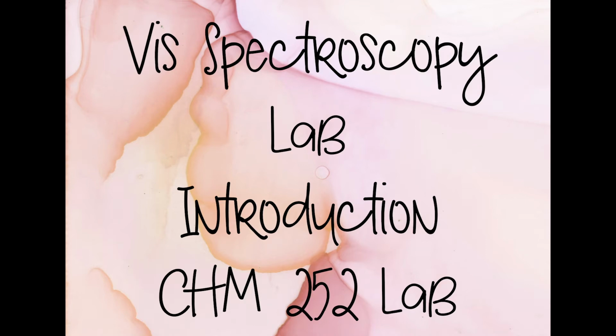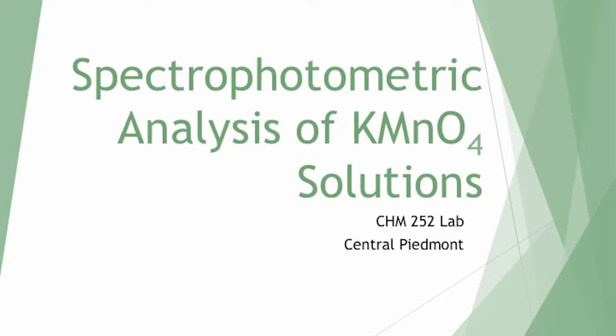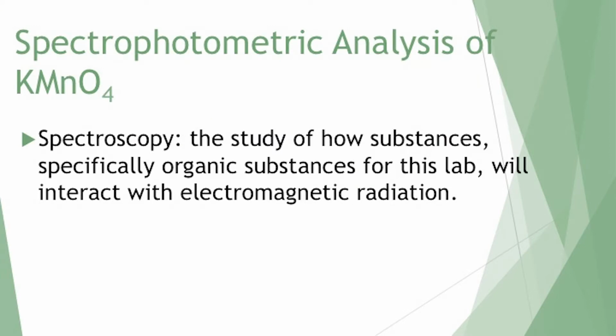Today's lab we're going to look at visible spectroscopy of a potassium permanganate solution. And when we look at the term spectroscopy, spectroscopy is really a study of looking at how substances, primarily in this class organic substances, will interact with electromagnetic radiation.